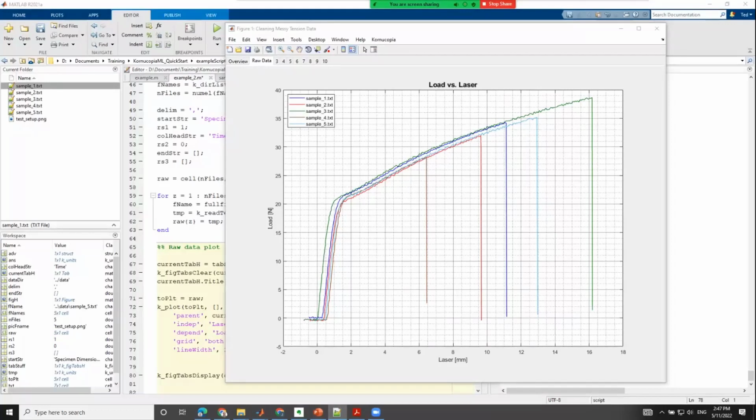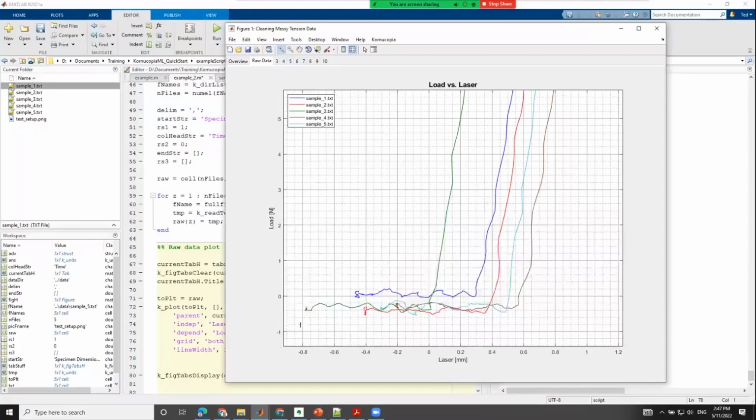All right, so now what we need to do is clean this data up. The data has some offset variation here at the beginning. It's also a bit messy at the very beginning. This is like a complete disaster here at the beginning, but if we trim this off, the rest of it looks a little wobbly, but it's salvageable. The beginning is not part of the material measurement.